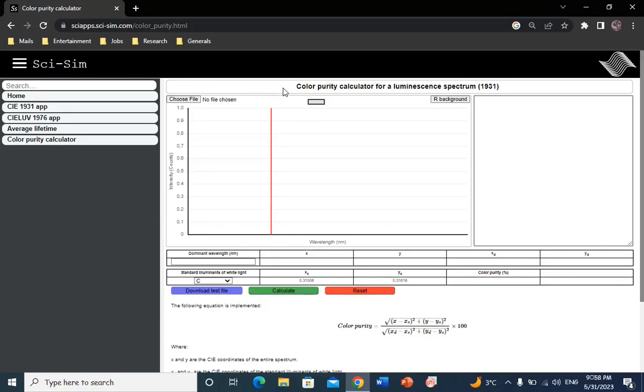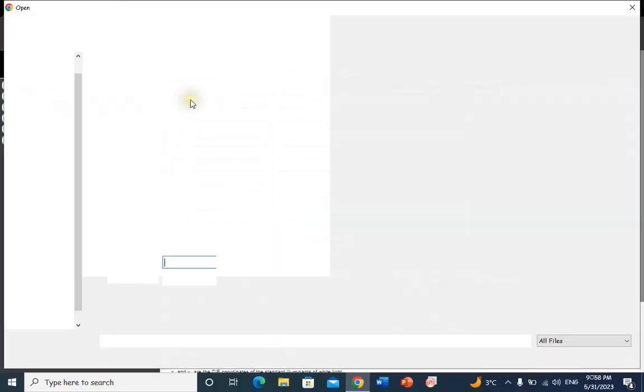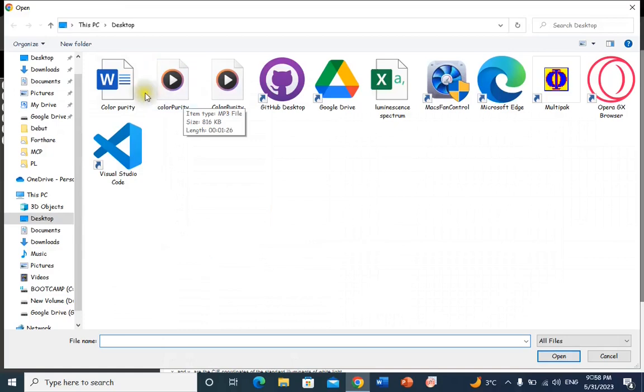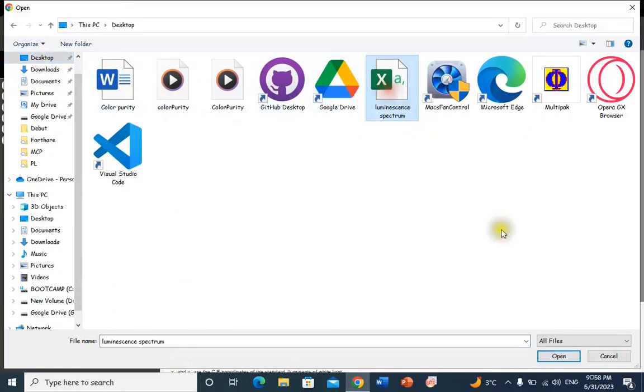Upload your file by clicking on the choose file button at the top left side. Navigate your desktop and choose your emission spectrum. Click open.